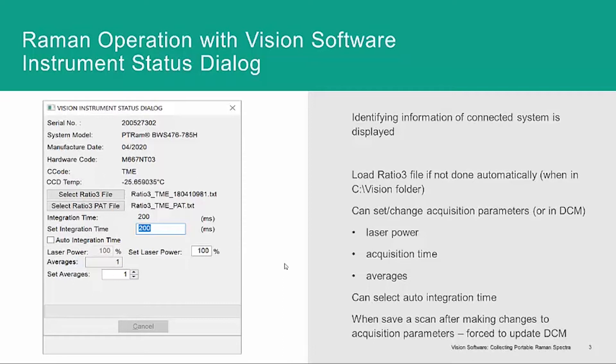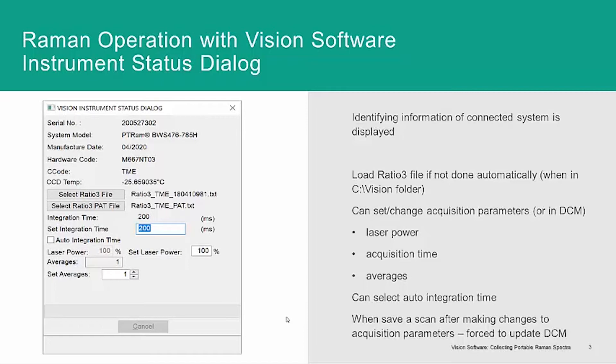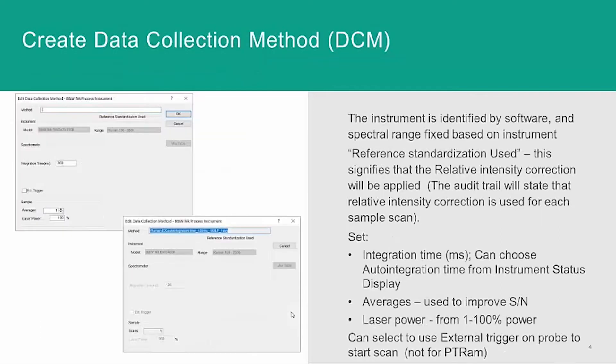From the instrument status dialog, you also have the option to select auto-integration time, and the system will find the maximum or optimal integration time to not saturate your spectrum. When you change parameters here in the status dialog and save a spectrum, that will also force a change and update to your data collection method, your DCM.